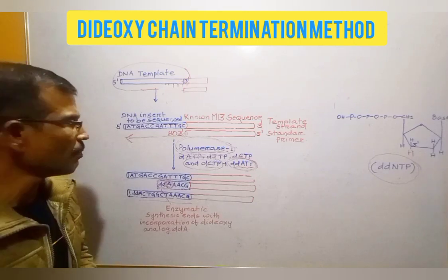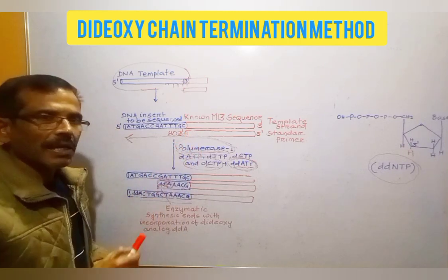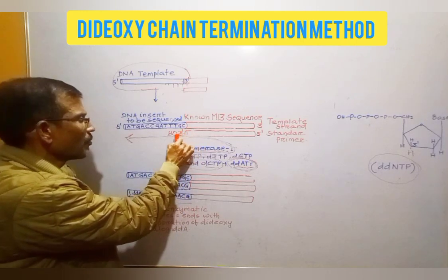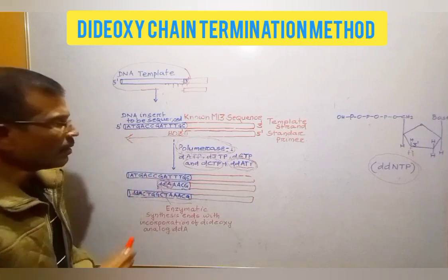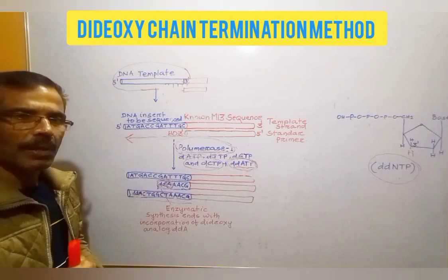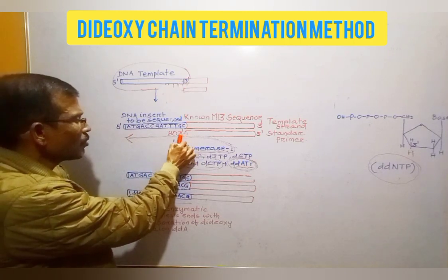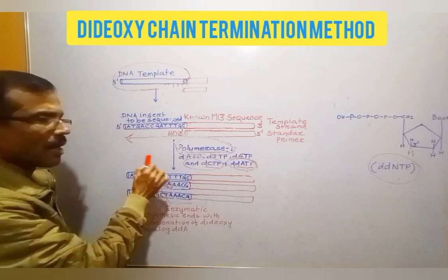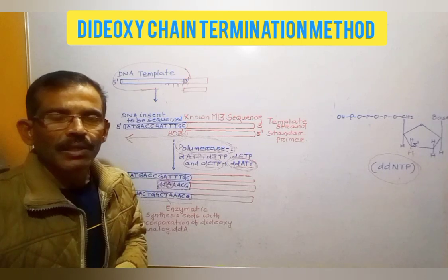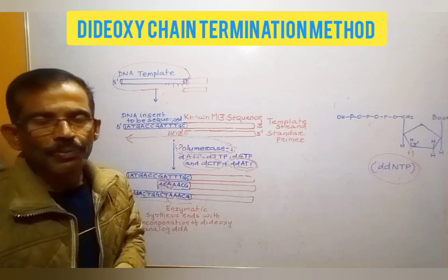in the reaction mixture. DNA polymerase 1 extends the primer by adding successive nucleotides to the 3' hydroxyl group in the 5' to 3' direction. The base sequence of the growing DNA strand is complementary to the base sequence of the DNA template. In this manner, replication will proceed in the 5' to 3' direction. Then how do we generate the nested set of DNA fragments? This is achieved by interrupting replication at different points of time.